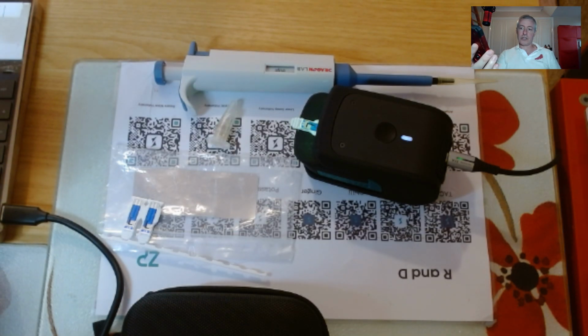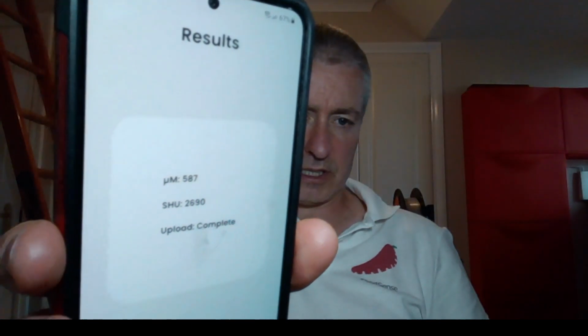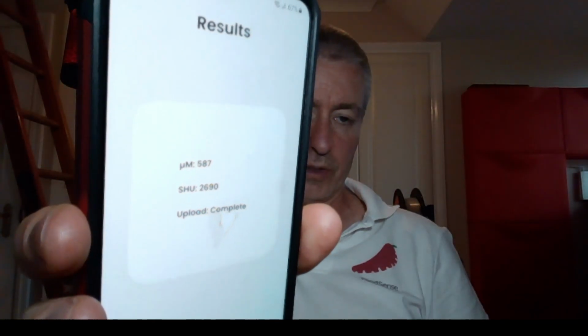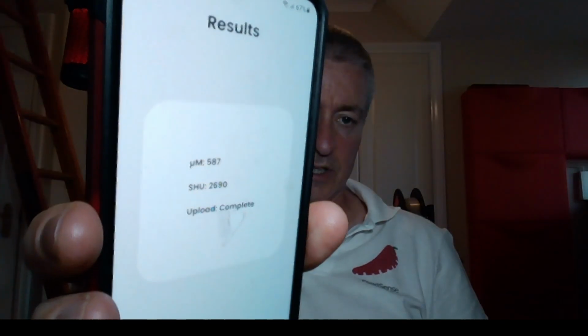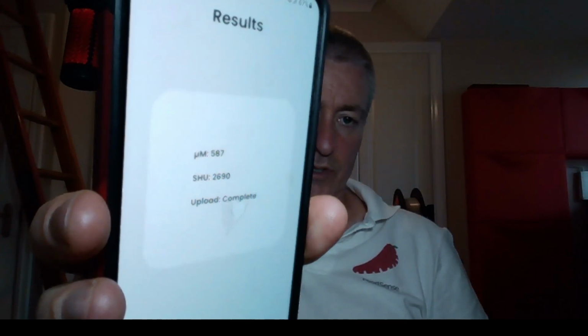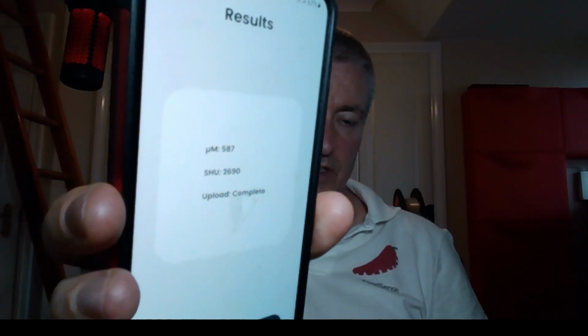So let's see what's going on here. Okay, so I'll change screens just for a second, just so you can see this a bit more clearly. Right, so it says 587 micromolar, giving me a Scoville Heat Unit of 2,690, and it says upload complete.